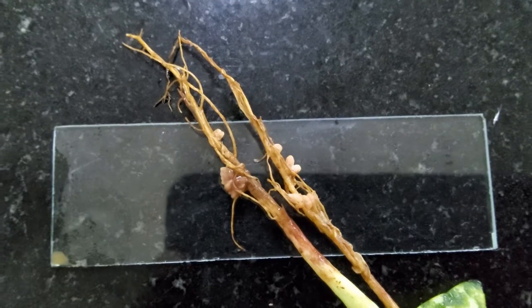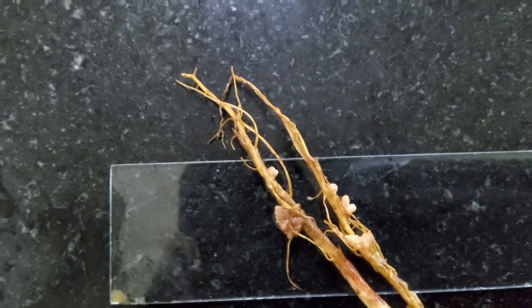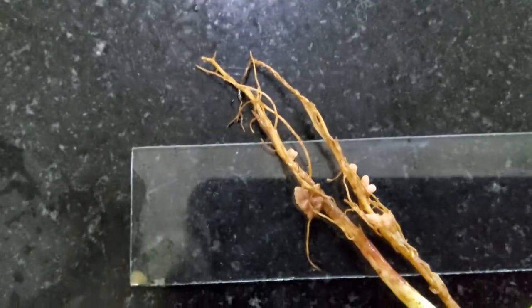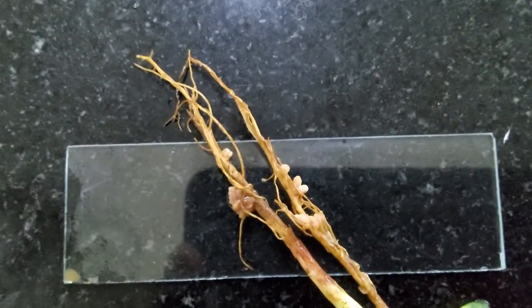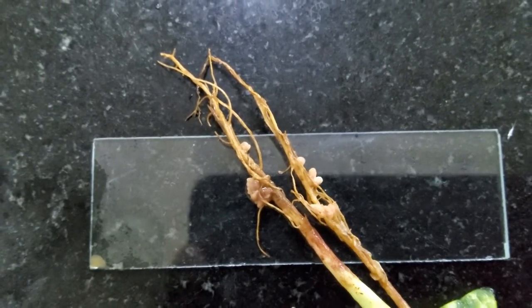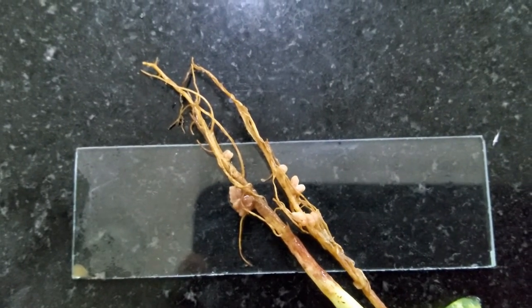Here you can very evidently see the root nodules present on the roots. We are going to separate these root nodules and crush them between two slides after they are washed well. The exudate that we get out of this is what we will be using for plating on the crema agar.